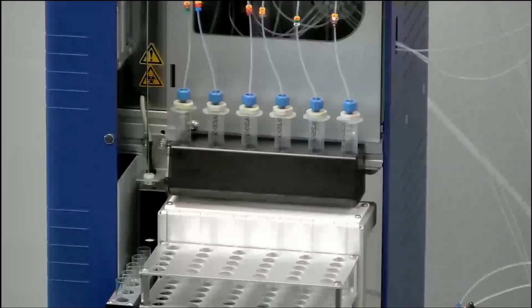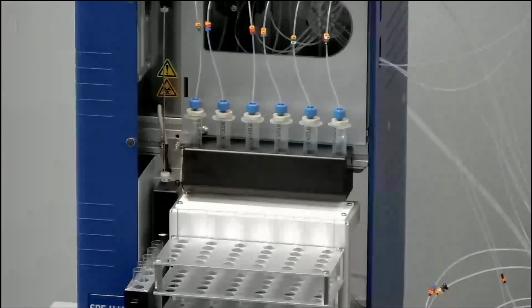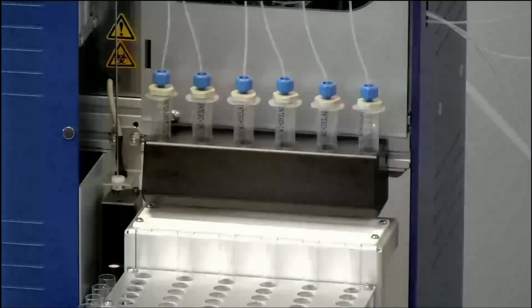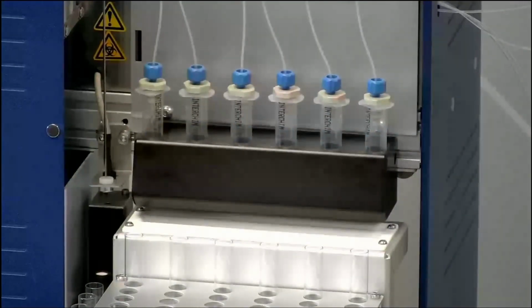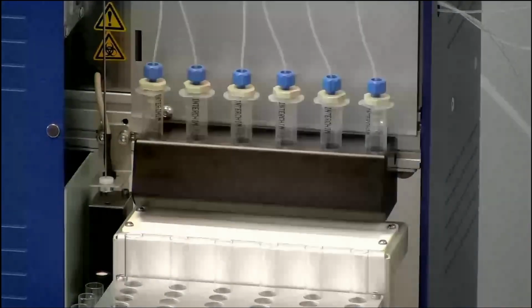So here, my system is in the condition step, so we load the water, and for example, here, my system is collecting inside the aqueous waste container. And you can control the flow rate. So here, as you can see, you have the drops of solvent passing through the columns, through the sorbent to activate your SPE columns. And you can control with the software, with each line of your method, the flow rate, from 50 microliters per minute up to 15 ml per minute.